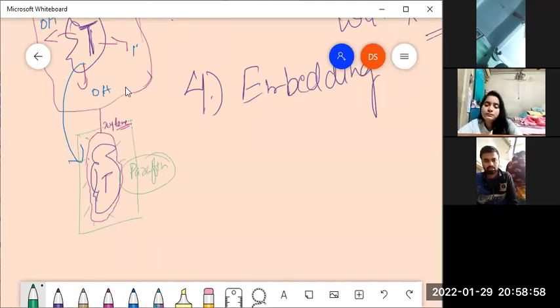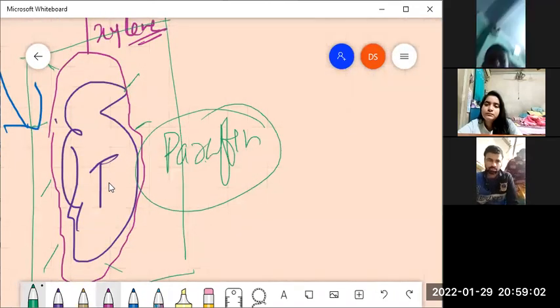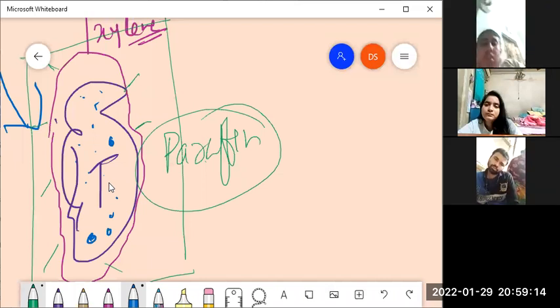That means if this particular tissue is collected, there will be cells inside this tissue. And the cells present inside this tissue would naturally overlap over each other because we are collecting a mass.